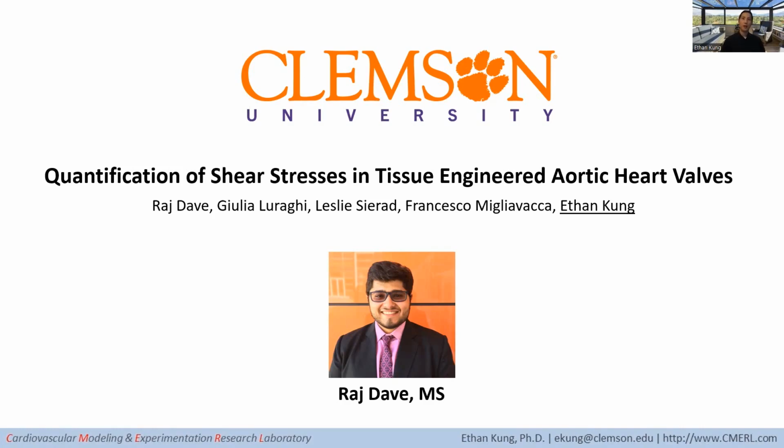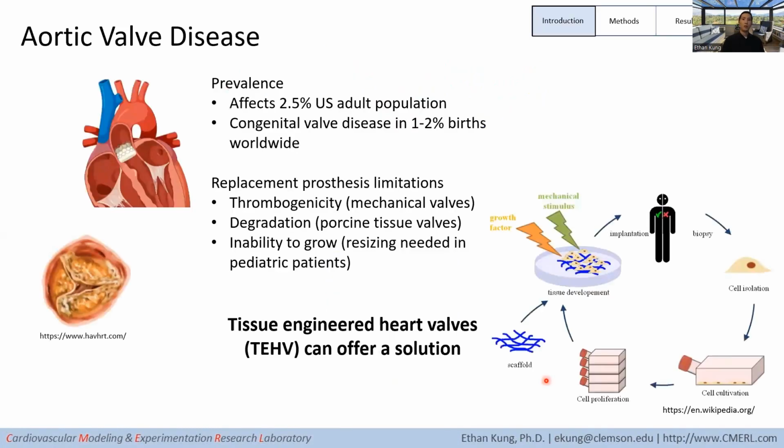Hello, everyone. The study I'm presenting here is the work of my student, Raj Dave, as his master's thesis. And the study is focused on quantifying shear stresses in a bioreactor heart valve. So some motivation for why we care about valves in bioreactors.